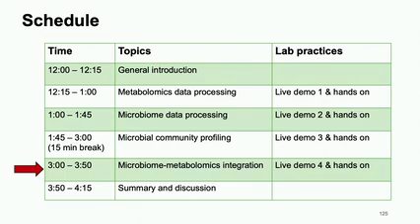If one approach gives you hugely different patterns and all of the others speak another story, you need to be very cautious whether it's an artifact or a true discovery. Overall they are consistent. We have different approaches talking about the same thing. Visually you see some patterns, but statistically it seems marginal, not so significant. Then you try different things, but all of them give you the same result. At the moment, which one works best is up to you as an expert in the domain: you leverage your knowledge, leverage the literature, and try to come up with how you describe the whole story.